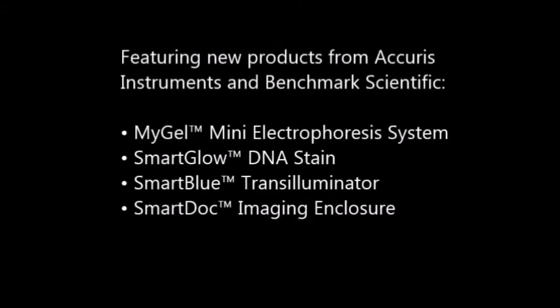During the demonstration, we'll be featuring some new products from Acurus Instruments and Benchmark Scientific, including the MiGel Mini Electrophoresis System, the SmartGlow DNA Stain, SmartBlue Transilluminator, and our SmartDoc Imaging Enclosure.